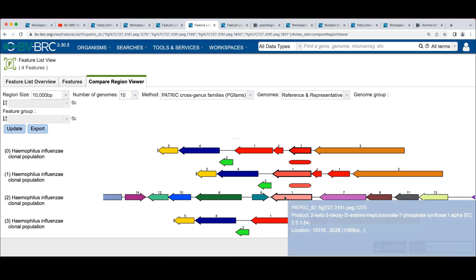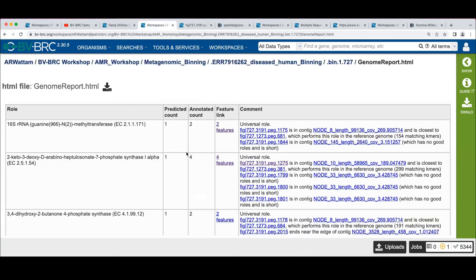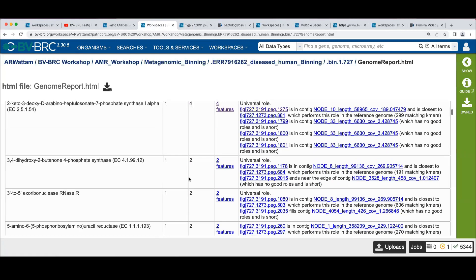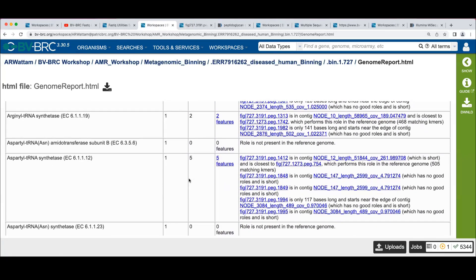Yeah, so this one's probably real. In this display, if you double click, it will go and switch the view to look at the one you clicked on. I'm going to scroll through this a little bit. I think there are 109 of these, so there's a lot to look at.